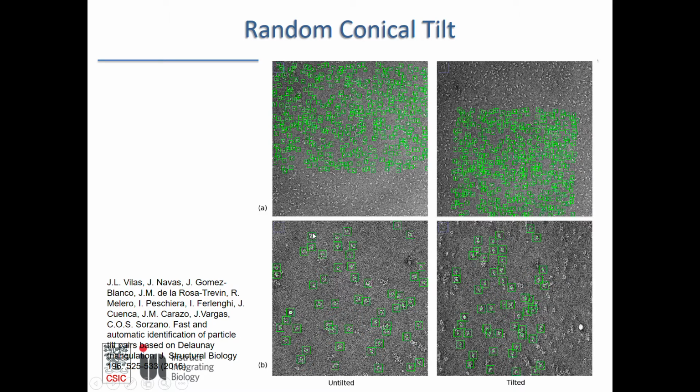You must identify, for instance, that these four particles here are these four particles, and then you click the pair. You say this one is this one, this one is this one. This is a very tedious process, especially because sometimes there can be big jumps and there are no distinctive features that allow you to make the correspondences, like the example up here.